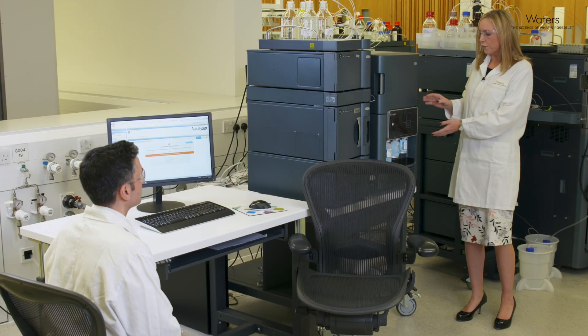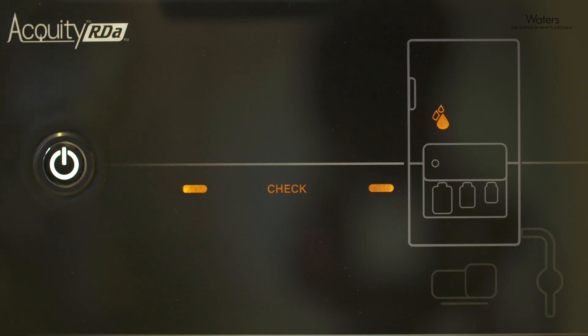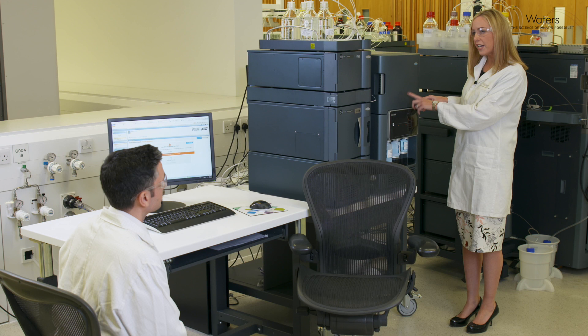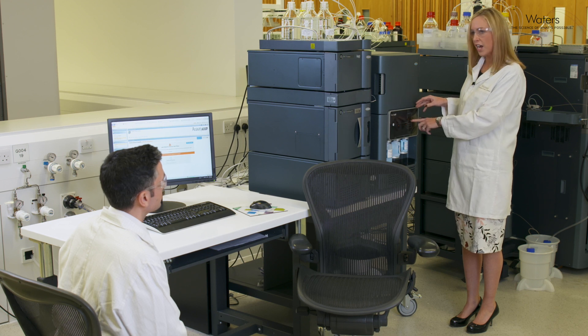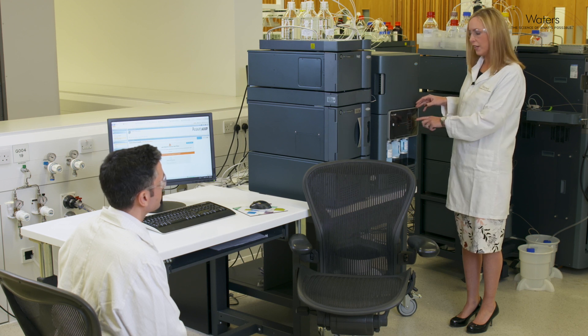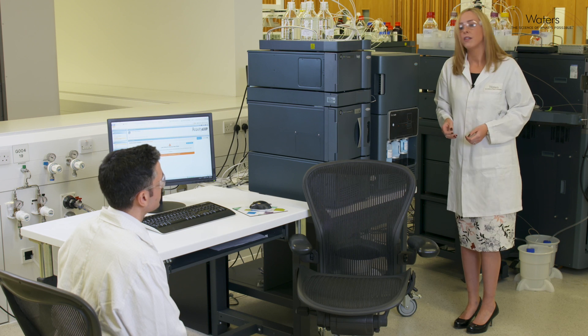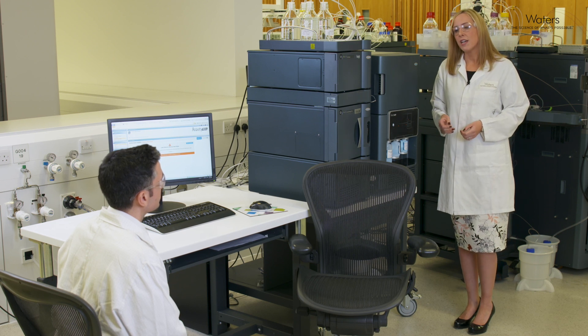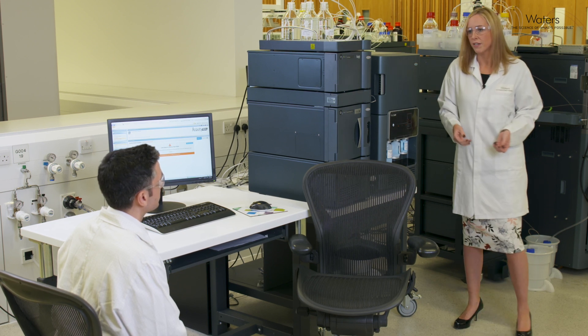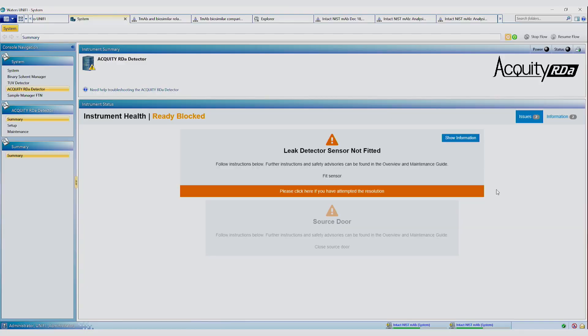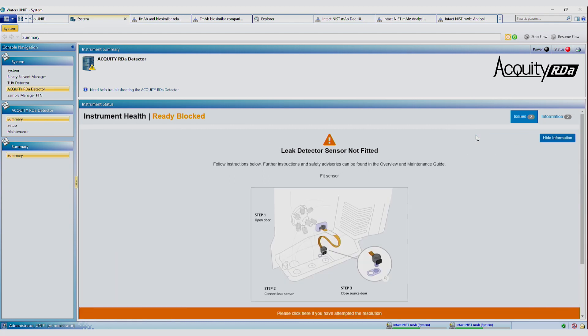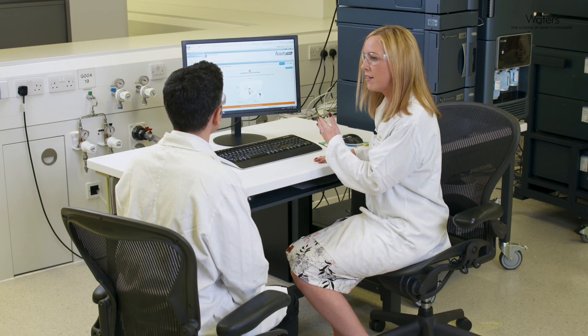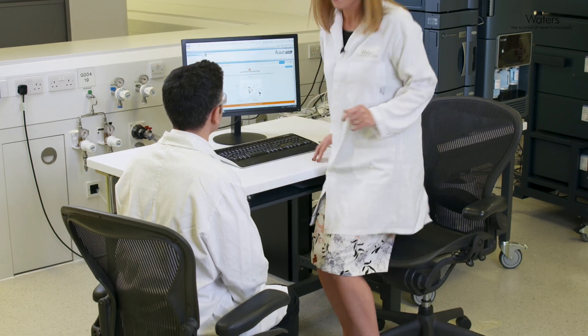So if you look at the front panel, we can now see that the status says check and it's giving indication as the location of the system where we need to check. And now we're going to come back to the computer and we can see the step by step guidance on how to remedy the fault. So it's telling us now that the leak sensor isn't fitted. If we click here to see more information, it's telling us whereabout the leak sensor is and how to check it so that we can do that. So I'm going to go back to the instrument now and follow this step.